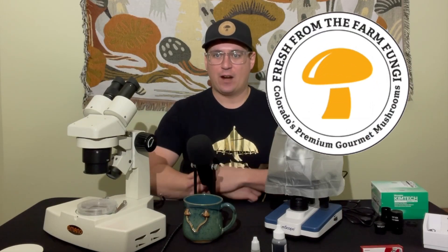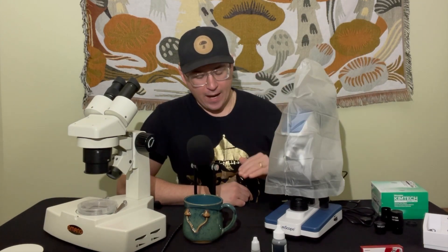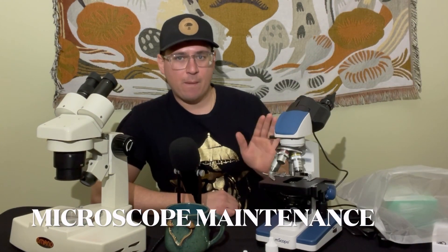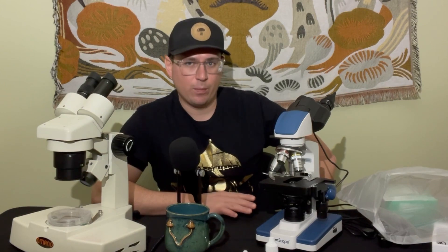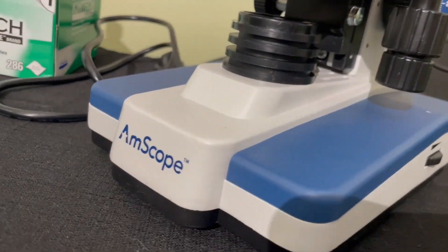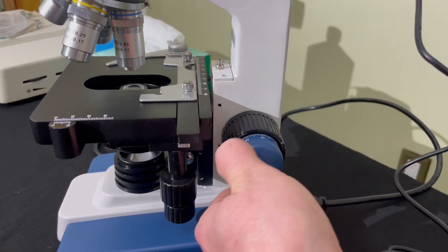What's up mushroom fam, it's Gary with Fresh from the Farm Fungi. Today is the third video in our microscopy for mycology video series, so if you want to go back and watch the first two, check out our playlist. Today we are going to talk about microscope maintenance. This is very important — if you're purchasing your own microscope it requires some delicate maintenance. A lot of people don't care for their microscopes and get turned off, but it's pretty simple: keep it clean and follow some rules.